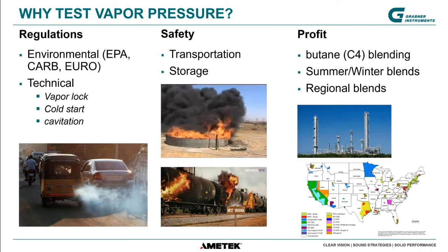Why do people test vapor pressure? Well, there are three main reasons. One of the key reasons where it started is regulations. Regulations have two sub-reasons. First, you want to avoid pollution, so there are environmental standards published by the EPA, CARB, or Euro. We all know the Euro 5, Euro 6 standards.